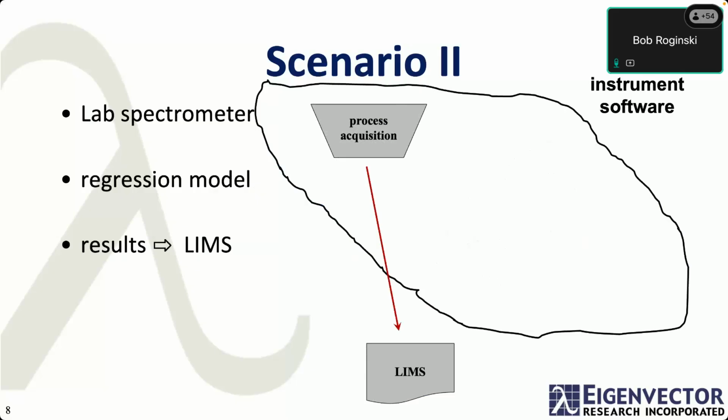But here there is a step that is required to get those results outside of, I'll call it, the instrument software infrastructure, and get them to another place.